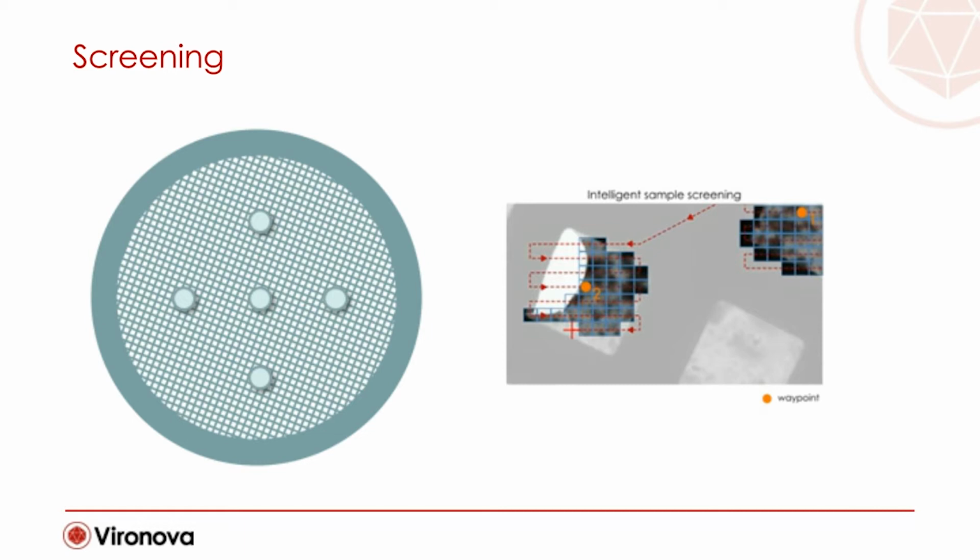You can tell the software to visit pre-configured waypoints with a certain pattern, or you can manually, based on a low magnification assessment, tell the software which waypoints to investigate. The system then screens these areas automatically using the inbuilt operational automations. Each waypoint will be visited and each area will be imaged in a structured way. This would take a few hours if this is done manually, which for an experienced expert would not be an attractive task.